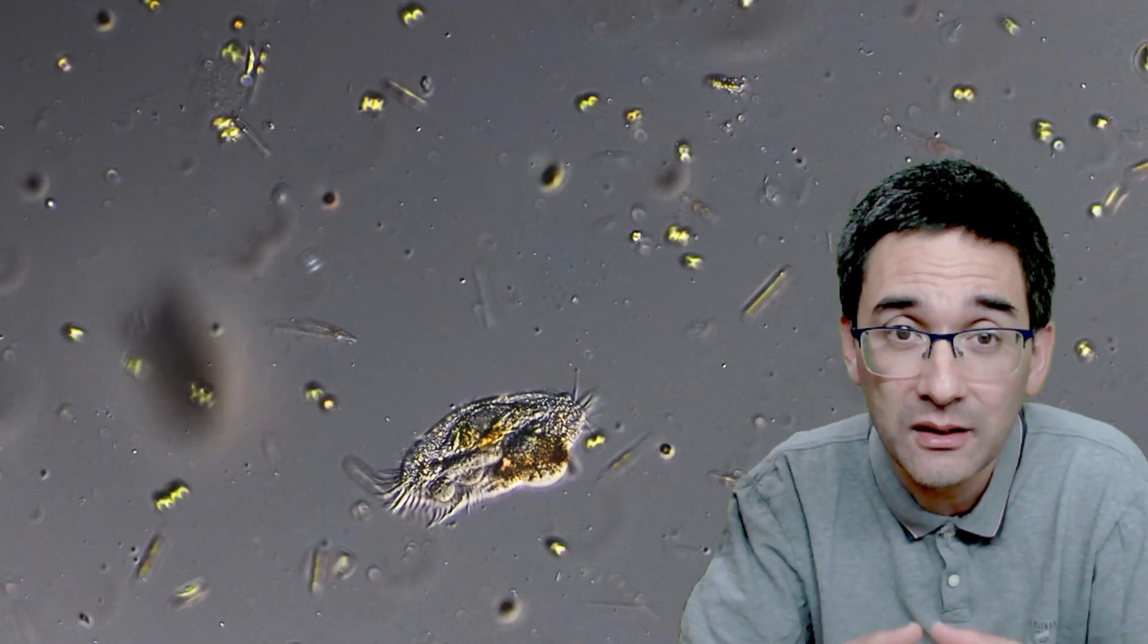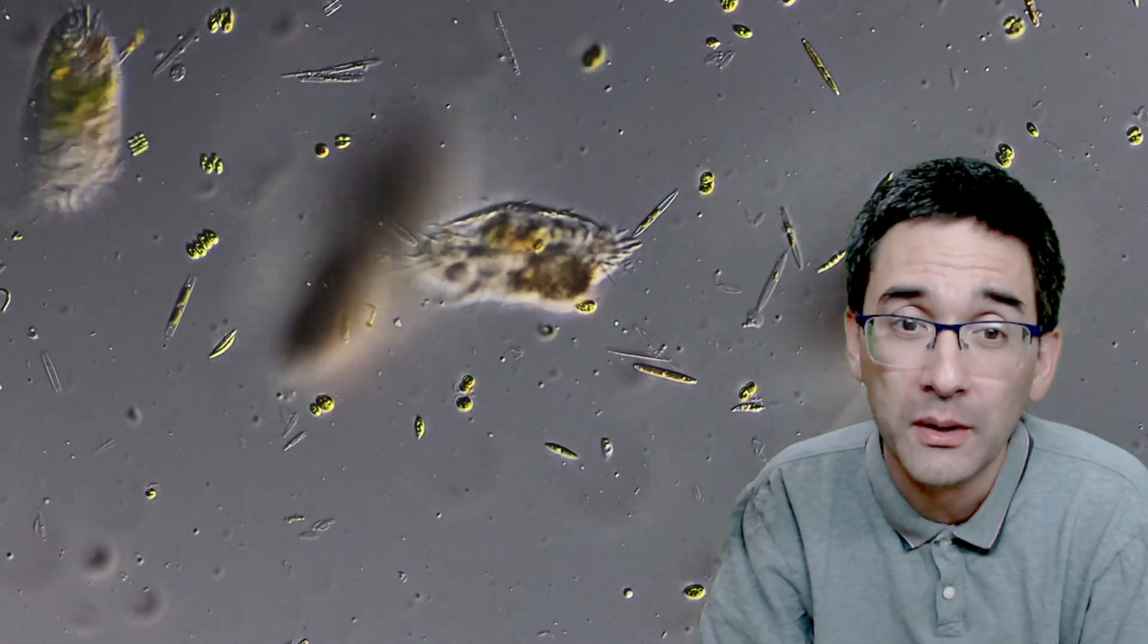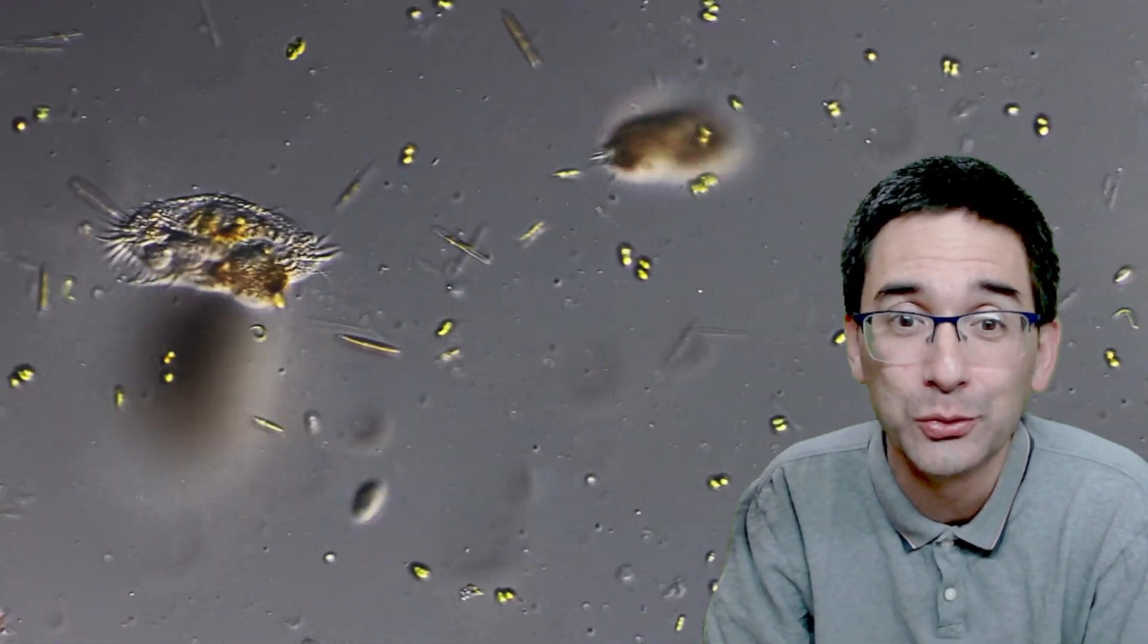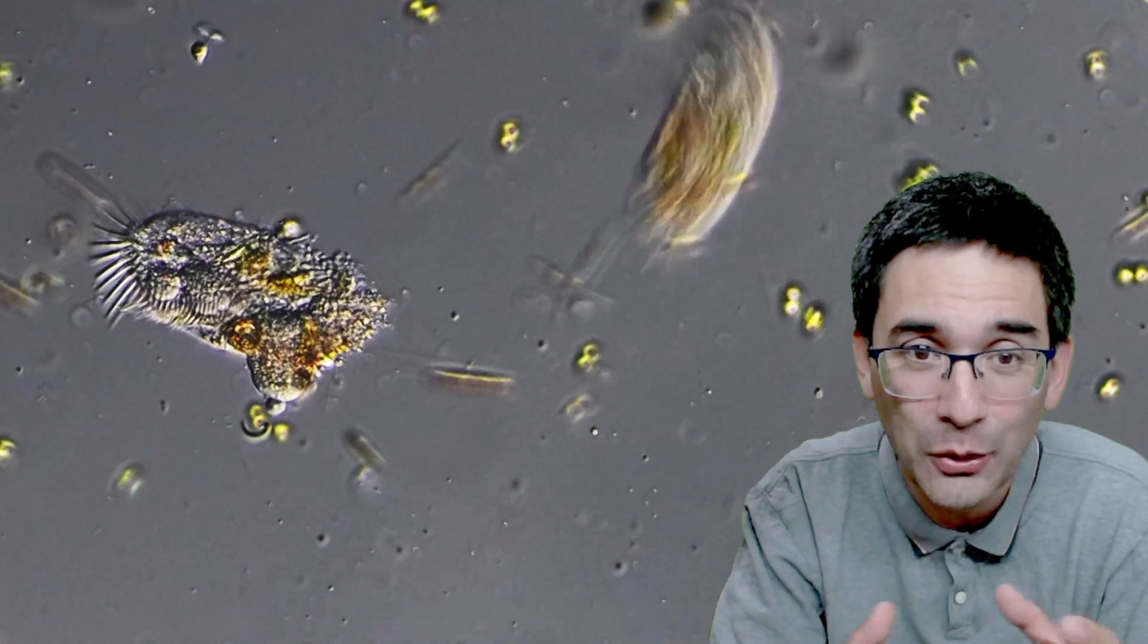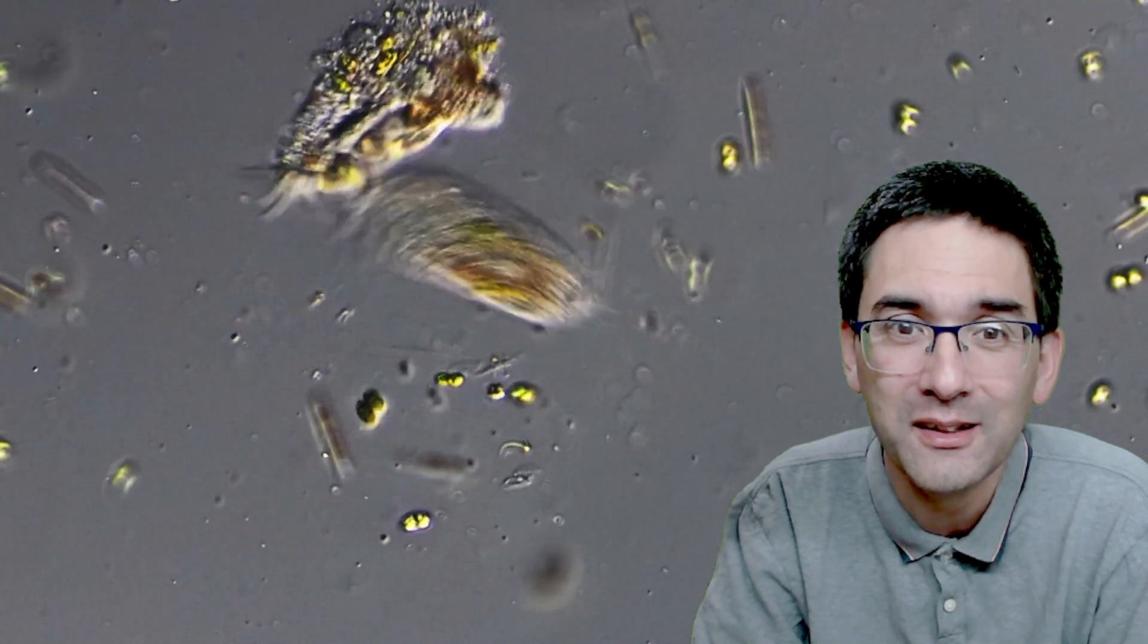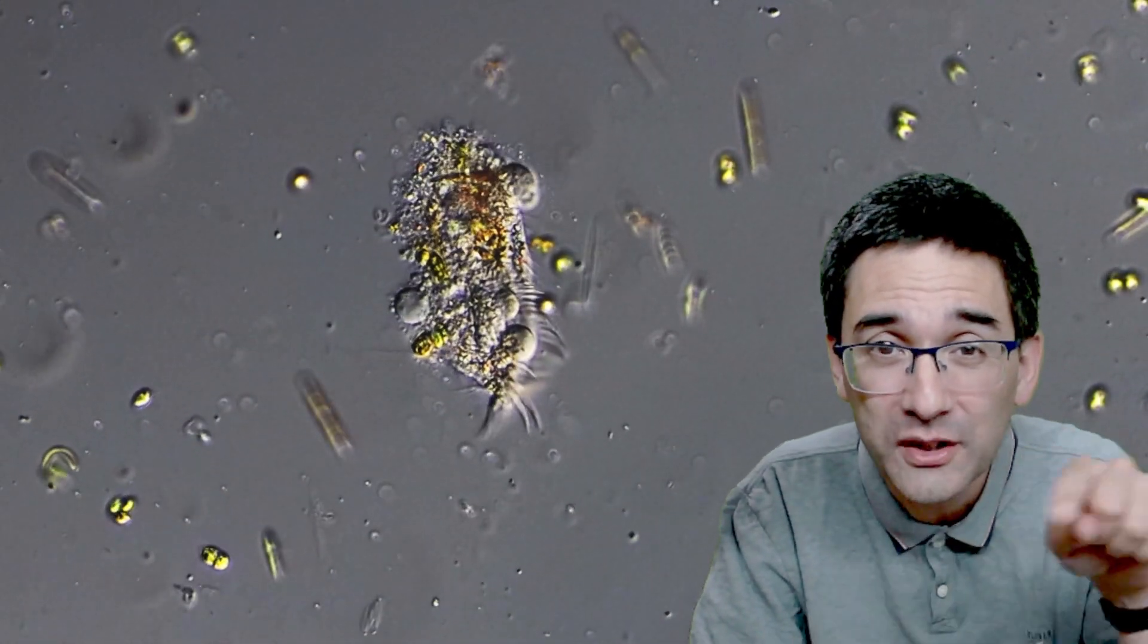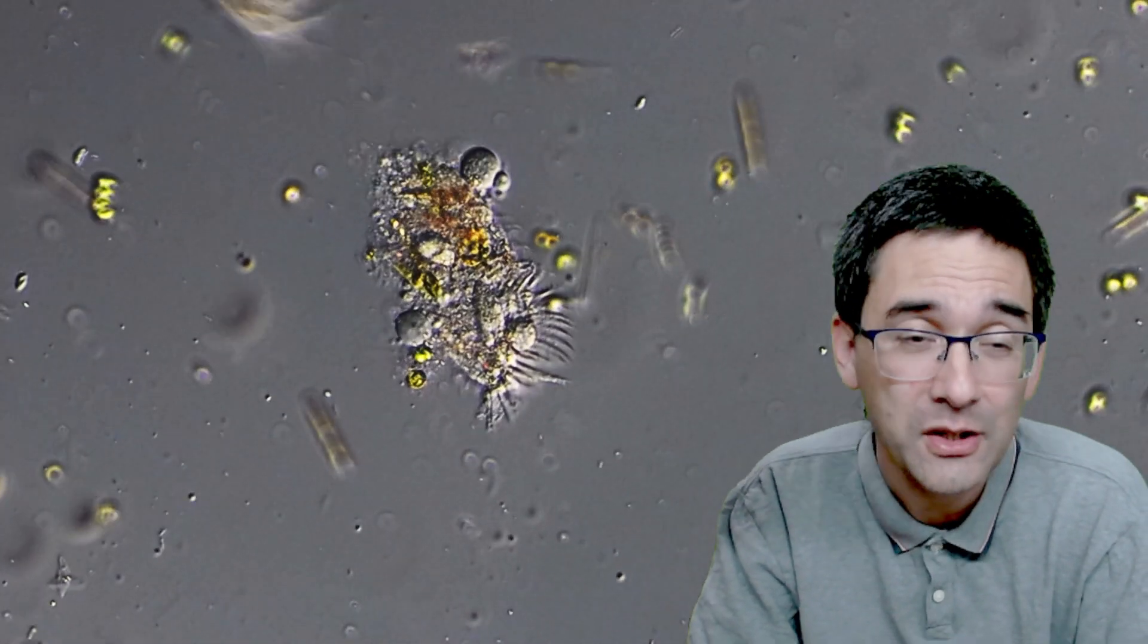This cell here also got a bit too much hydrogen peroxide and starts to break open now, spilling out the cell's contents. But the others are still swimming around. Before they die, they start to go in a circle—they lose control a little bit. You see that the action of the hydrogen peroxide, at least in this case, is not quite as fast as when I'm adding the alcohol-containing disinfectant.